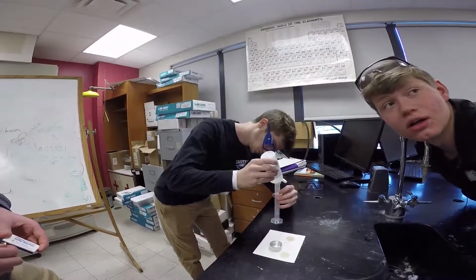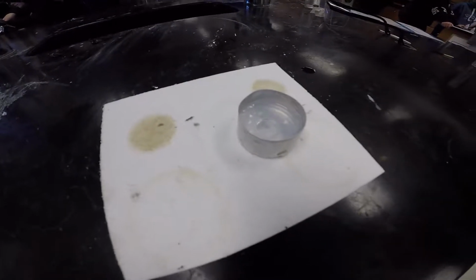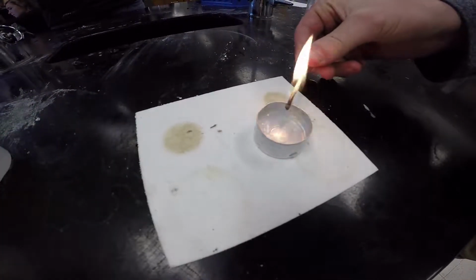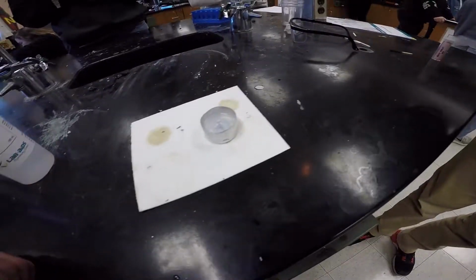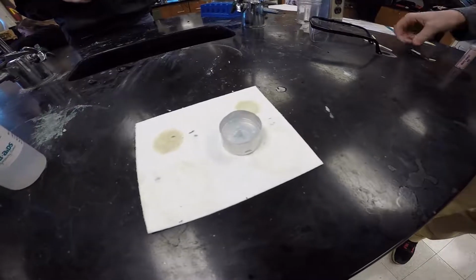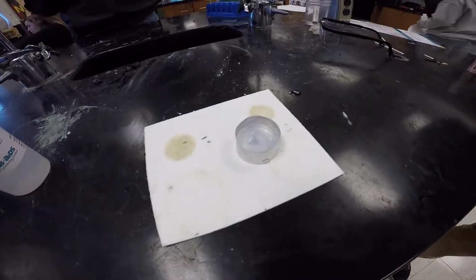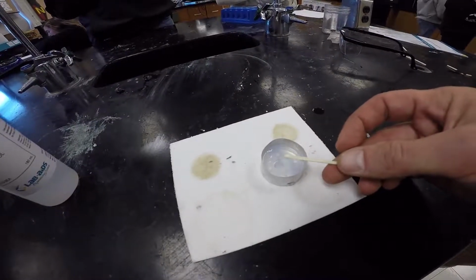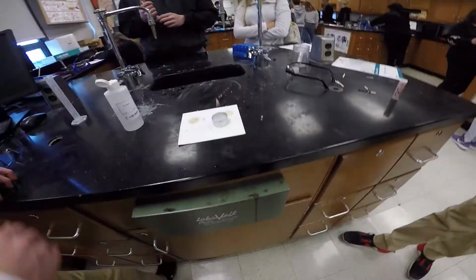Can you see me? No, put your goggles on. Where do I go? Do I go low? On top. Like that? Yeah, it doesn't look like it does it. You need a hatch. It's lit, dude. So you can see that. That's pretty nice, though.